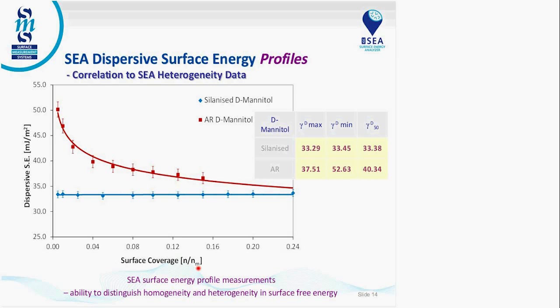Because we know the BET surface area, we know exactly how many moles are required to cover the complete monolayer, which would kind of wet the surface of the material. So this is a fraction surface coverage.